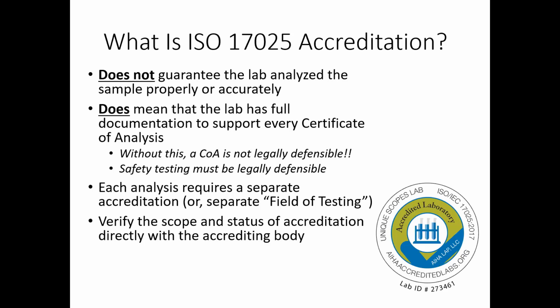And you can verify these things. So this is our logo or whatever you call it from our accreditation. You should be able to find these kind of things for anybody you work with, and you should be able to independently verify them. We can be suspended and don't necessarily have to say anything about it. So you can verify the status.